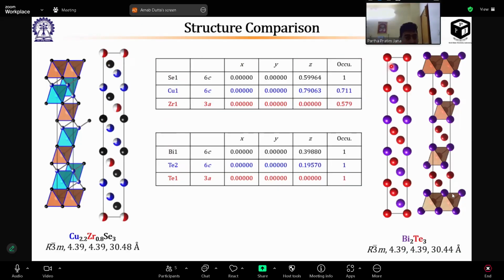So this is, Kedar, just for comparison, okay. They are the same structure type actually, but with different cell parameters. Only one crystal we have solved, because Arnav is resynthesizing the sample. Okay, so we will once again have a look. He just wanted to show you that this is another compound he found which is structurally related to bismuth telluride, a very well known compound among the thermoelectric community. Amazing.